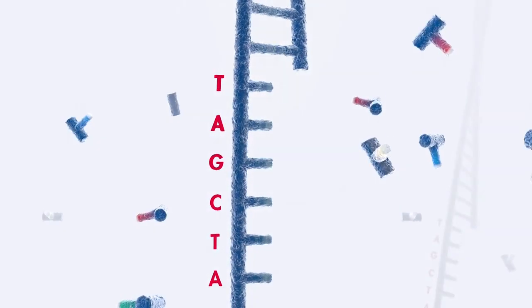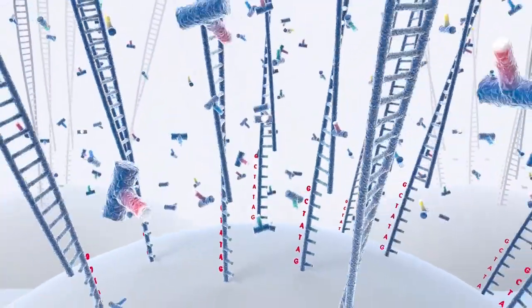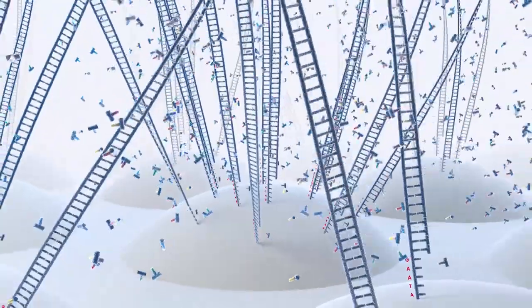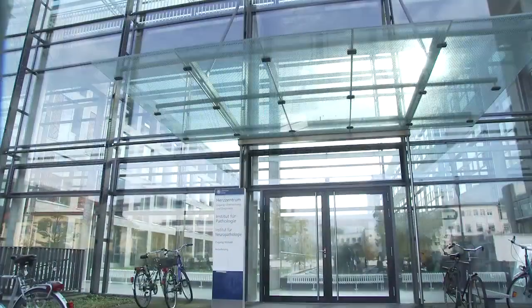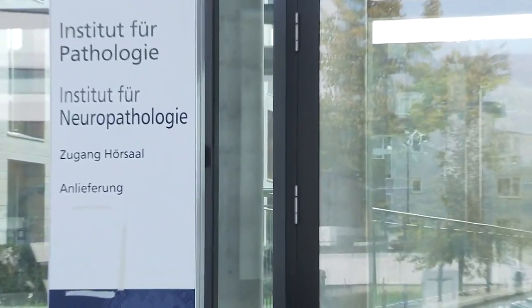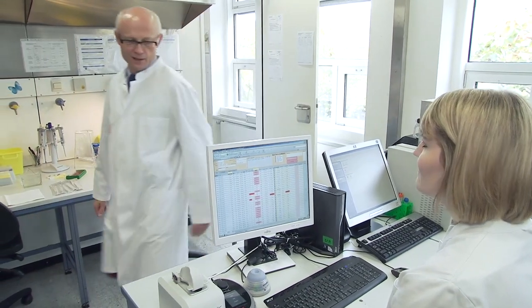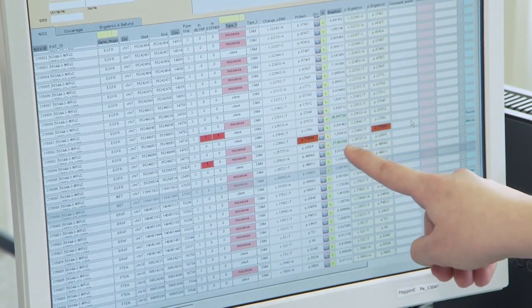Next-generation sequencing technologies, or NGS, play an increasingly important part in this. They enable us to quickly and cheaply analyze even large amounts of genetic data, such as the complex genetic structures of a tumor. Leading institutes and hospitals already use sequencing data to diagnose rare diseases and to customize cancer treatments. However, there are still obstacles hindering the widespread adoption of NGS technologies in everyday clinical work.